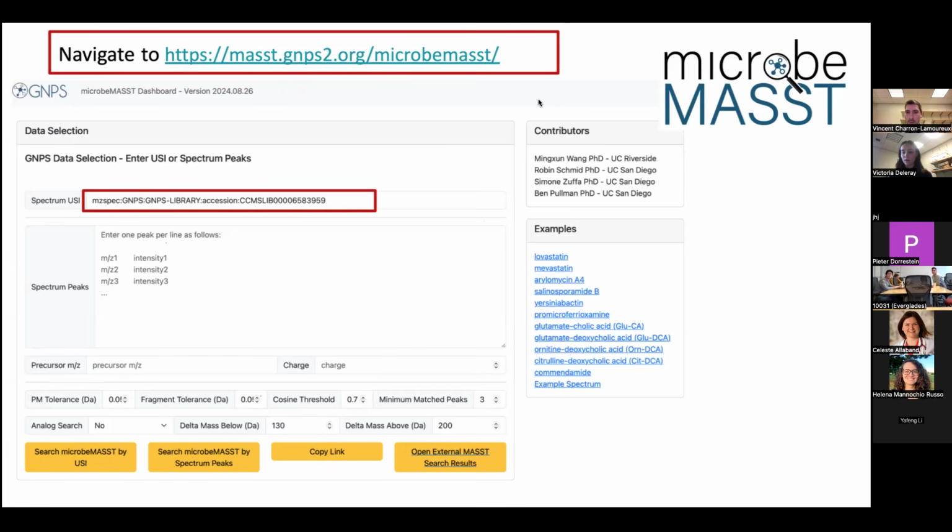It happened to me when I cloned the project from Vincent's GitHub. Yeah, I can replace those files on the GitHub if this is an issue. Let me send here the last table from the histidine so people can have it. Thanks for letting us know, everyone. So if you re-download the file and rename it, I think the script should work.